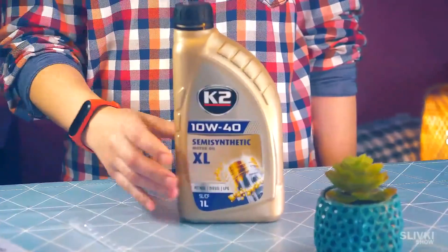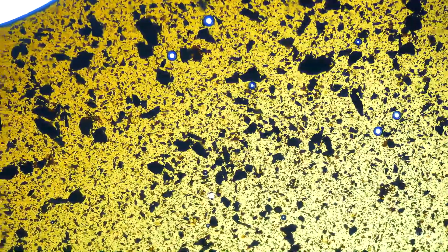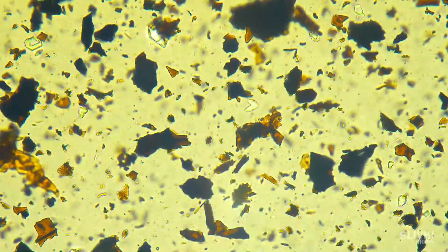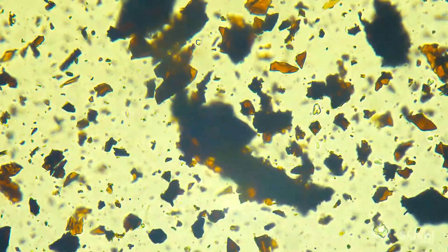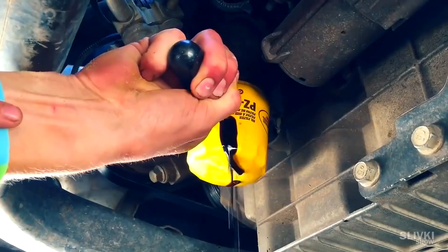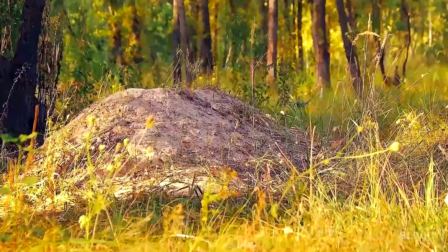We also bought new oil at the store. Both samples were placed on the same glass. First we take a look at the clean oil — in essence, it is absolutely transparent. Now we switch to the used oil, and we see a lot of different debris. Probably there are pieces of metal scraped off the engine cylinder. It would probably have been useful to look at the oil filter too, as it collects all the dirt. So don't forget to change the oil in your car on time.